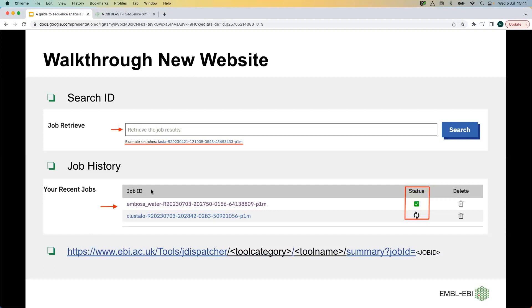You can also view your recently submitted jobs from the recent jobs section on the homepage — you will see a list of your five most recent jobs. If you expand it or go to the 'Your Jobs' tab, you will see the complete list of your jobs. From this section you can see the status of each job, whether it's running or finished. If you want to remove any unwanted entries you can delete them, but note that deleting a job from this list will not remove the results from our server — you can still access the job by visiting the link, and the job is available for seven days.